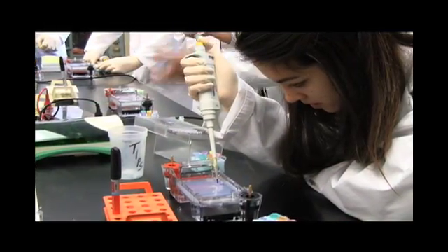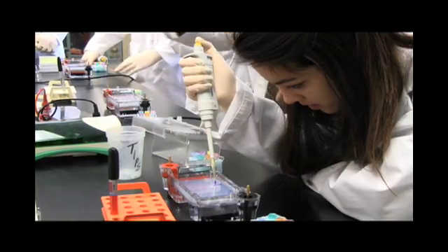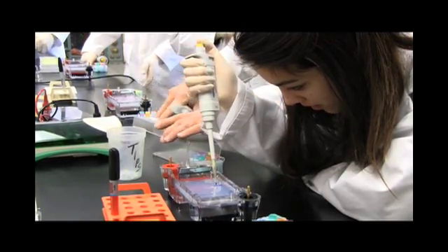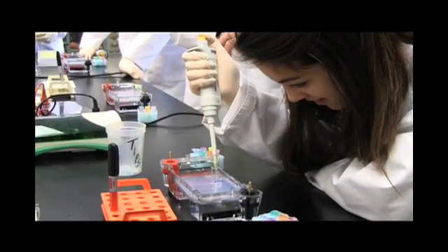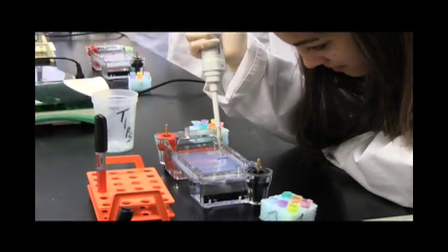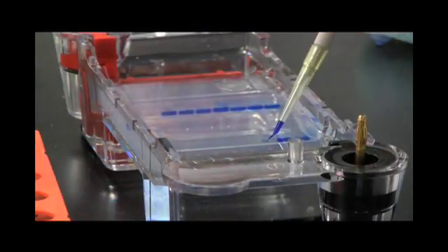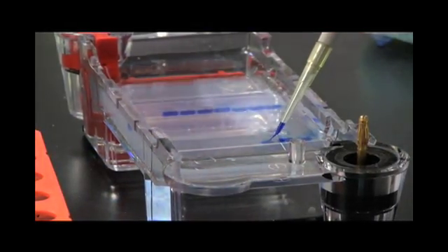The first well is the ladder—our control. This is a DNA sample that's already been cut into many pieces. In lane two you'll put your crime scene sample, and then in lanes three through seven you'll load your suspects. Lane eight will stay open.